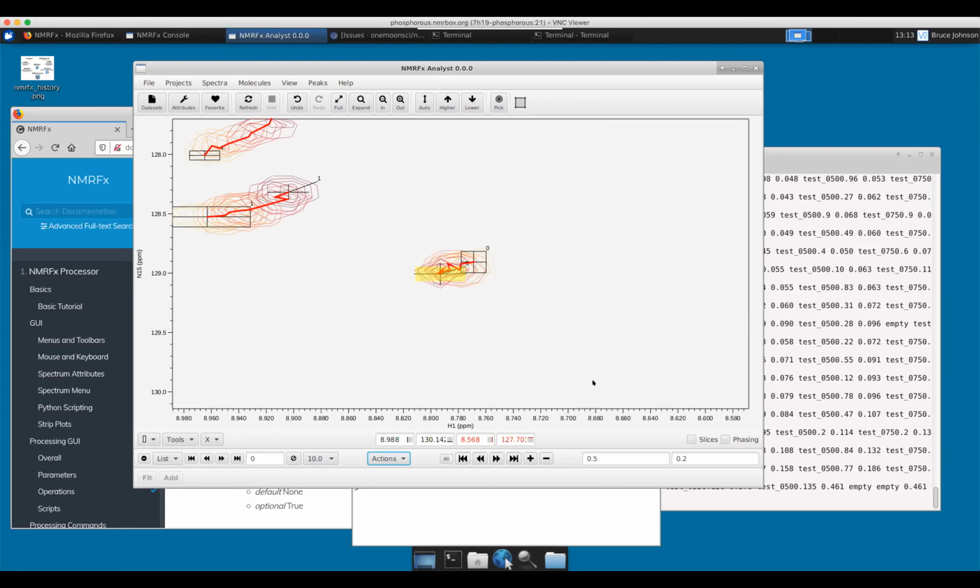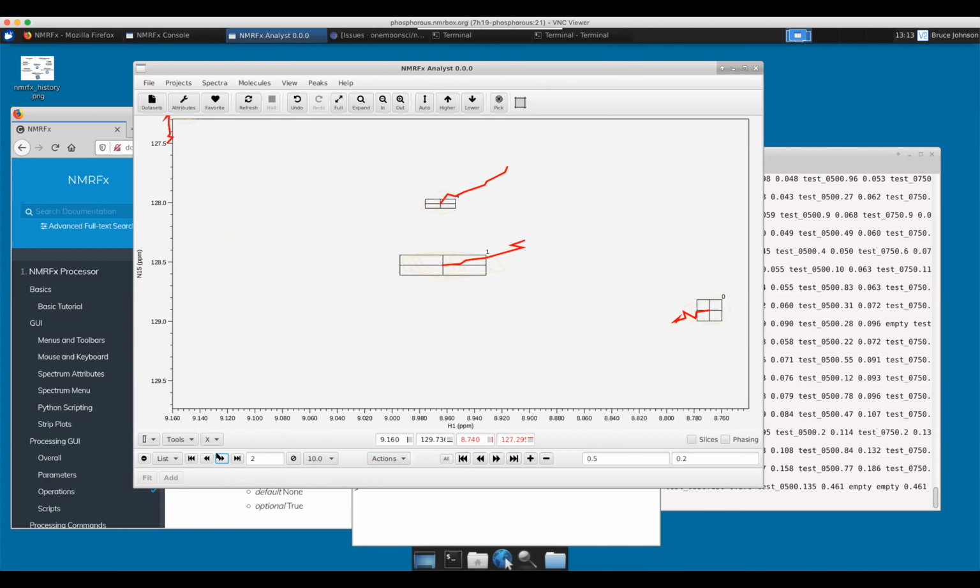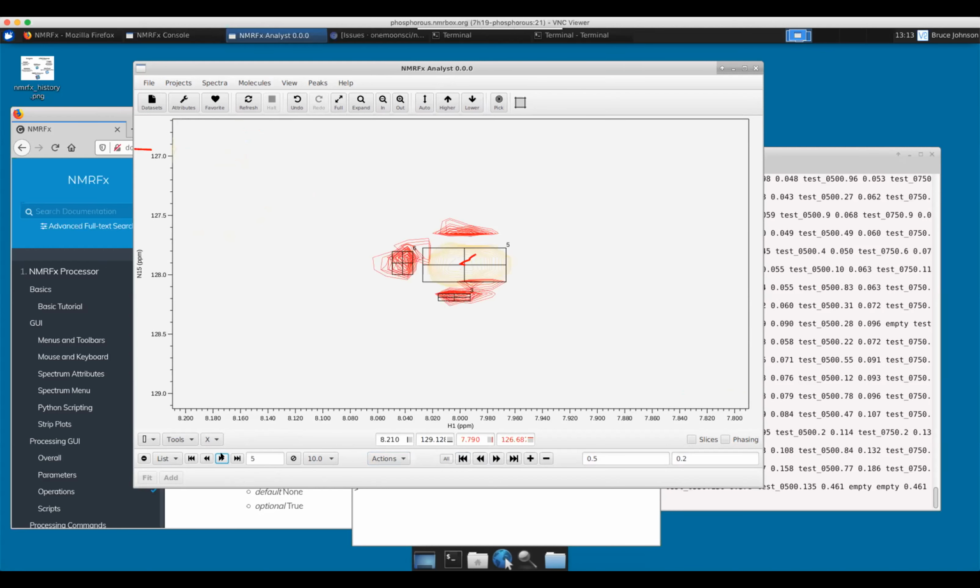I'm sorry, that's really weird. I cannot figure that out. Like I say, yesterday it worked. I fixed the one problem. I don't see how fixing the one problem is going to break this, but apparently it did. I will just summarize what would have happened, because it was pretty nice.